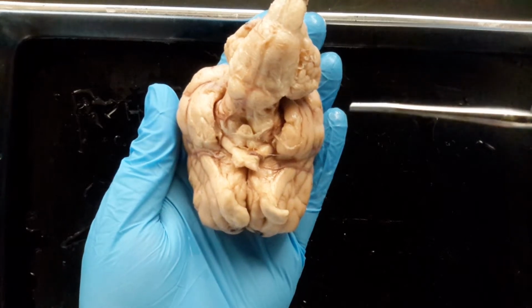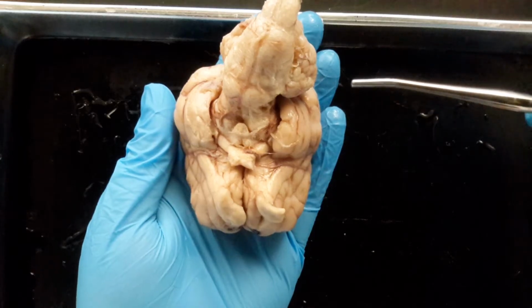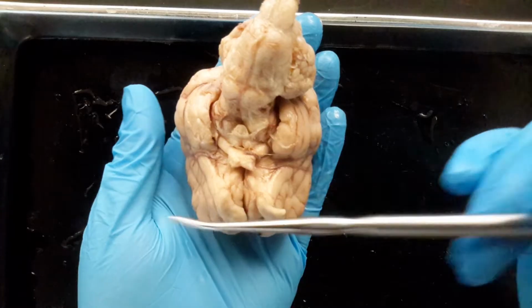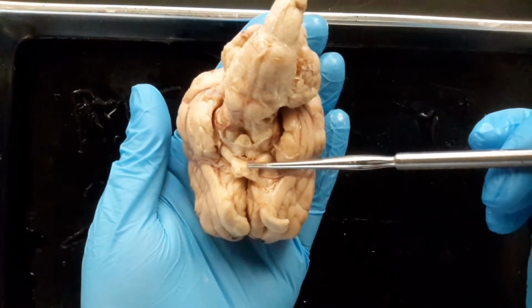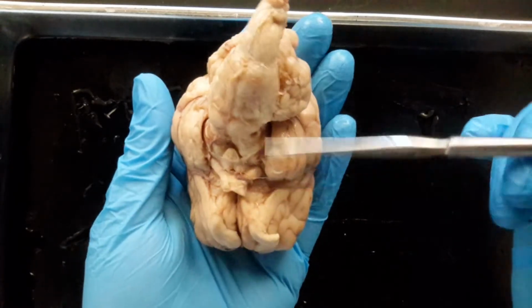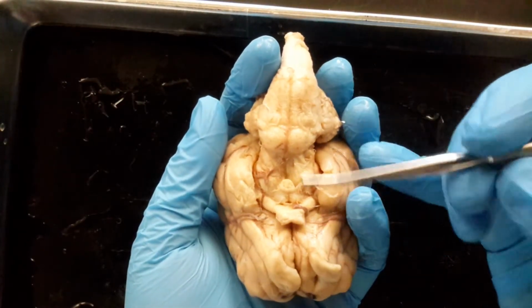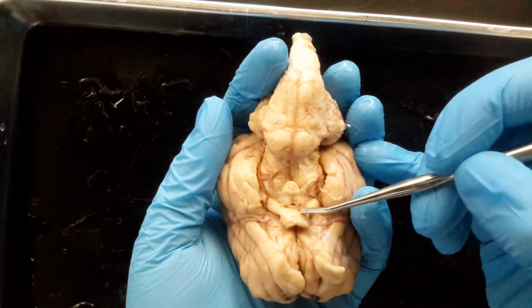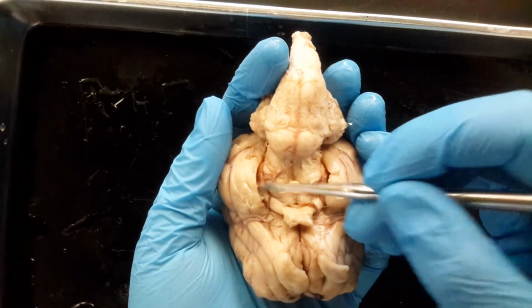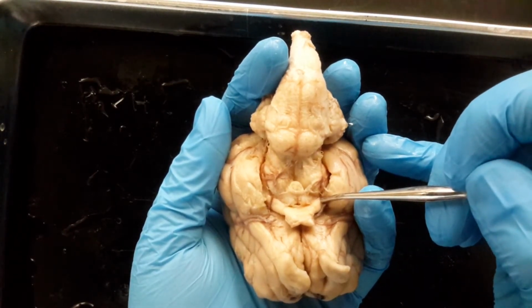That is cranial nerve number what? 1. Okay, cranial nerve number 2 is our what? Optic. Excellent. So, unfortunately, most of these brains, they cut the optic nerves really short. So what most of you are going to see is a little X right here, and then I'm going to move that blood vessel out of the way, and then these white myelinated tracts going back to either side. They go back to the occipital lobe.